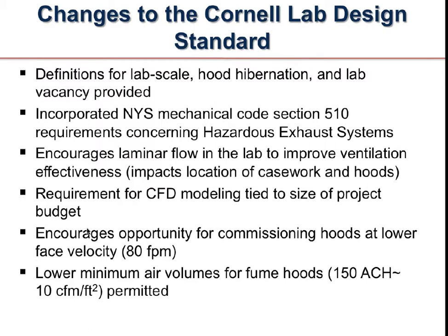Some of the things that we've added in or changed, we didn't have some definitions. A lab scale work as defined by OSHA is not pilot scale. It's very different. And we have researchers that are moving into the pilot scale work because of their research, because of their grant work or whatever other work that they're doing.